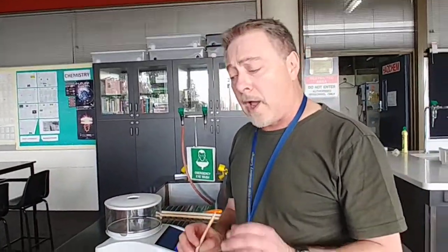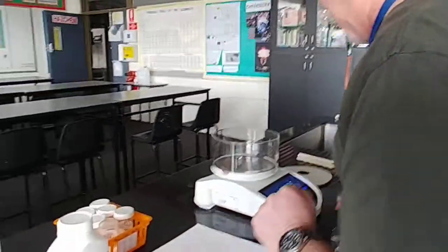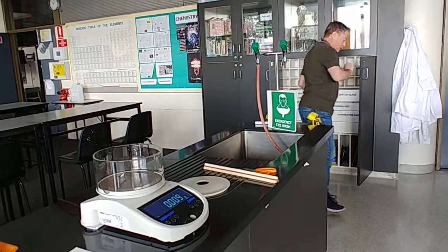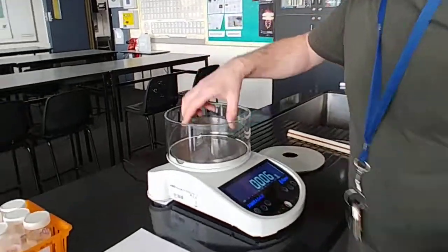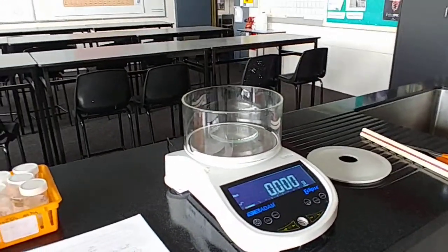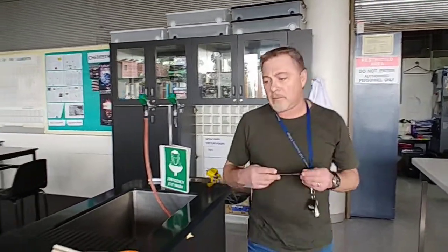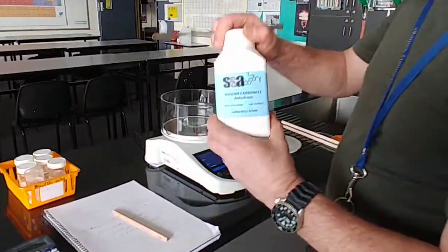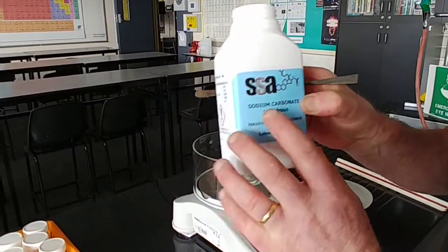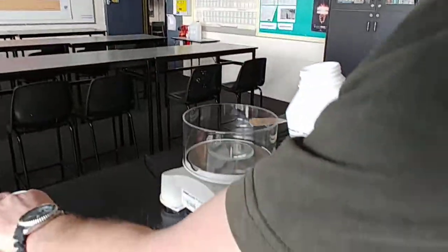What we need to do is weigh out an accurate amount. So here we have our analytical scales, we zero them, and we'll get our clean watch glass and we'll put it in there, zero that, now we get our analytical grade. Now most of you, when you do this experiment, we don't give you the commercial container, we give it to you in the smaller containers, guaranteed it's the same stuff. So let's weigh this out.